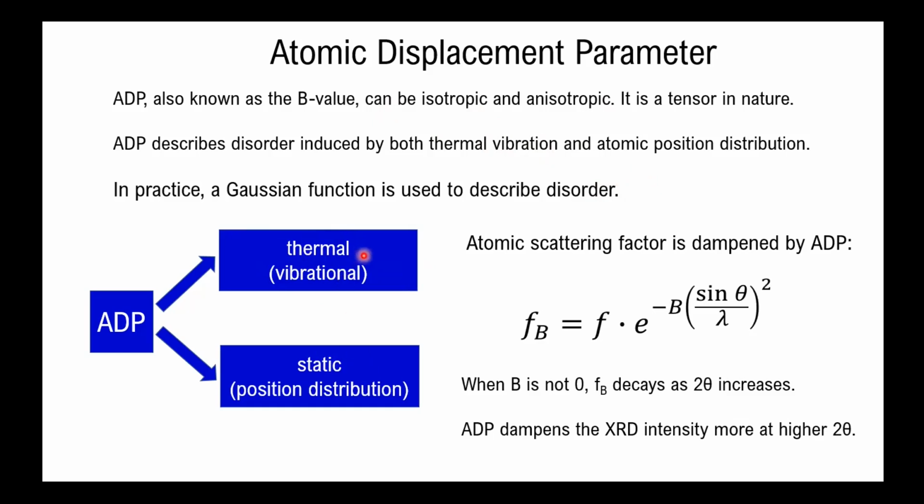We know the atoms are not still. They're vibrating all the time. Even in a rigid framework, as in the case of a crystal, even though we picture the atoms as fixed in specific positions, they are still going through small vibrations. So this gives an uncertainty of the position at a specific time. It is kind of smearing out the real position of the atom.